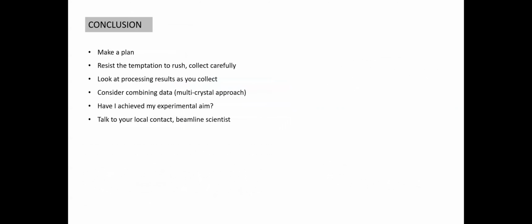So in conclusion, make a plan, and resist the temptation to rush, even though you could collect data sets now in seconds. Collect carefully, and also look at the processing as you collect. It's quite important, because it tells you if you can carry on or if you need to collect more of the same project. Consider combining data. Multi-crystal approaches are very important and are becoming more important these days. And the question you should ask yourself again is: have I achieved my experimental aim? And always talk to your local contact before, during, and after the beam time.